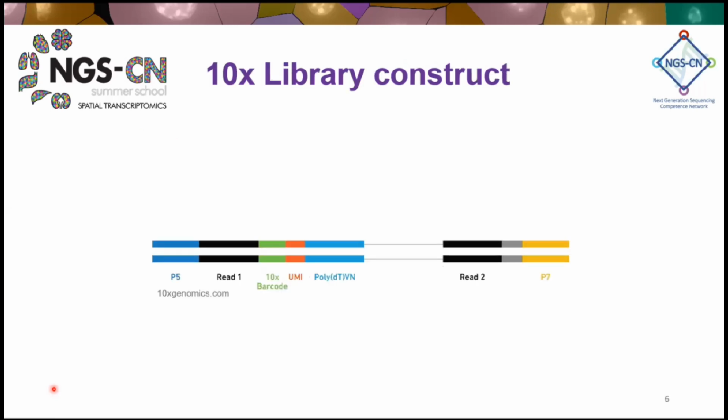So now the question is, how do we know what is in our read data? In my experience, it often helps to first have a look at the library construct. I would always suggest, if you have, for example, a certain single-cell sequencing technology, to go to the website, where they have the protocols, but they also outline the final structure of the construct. When you look at this, you can already guess what will be inside your reads.